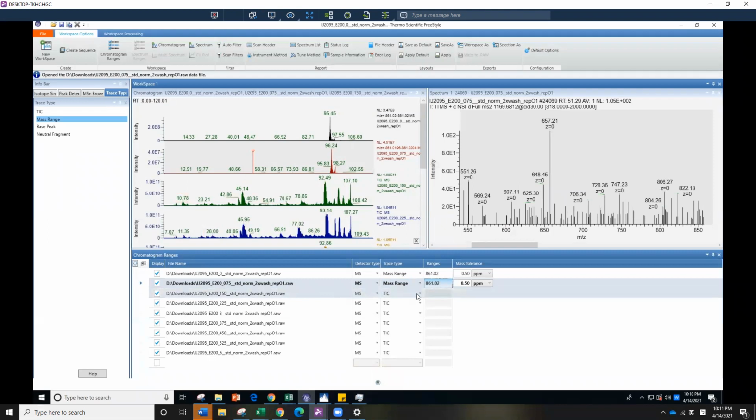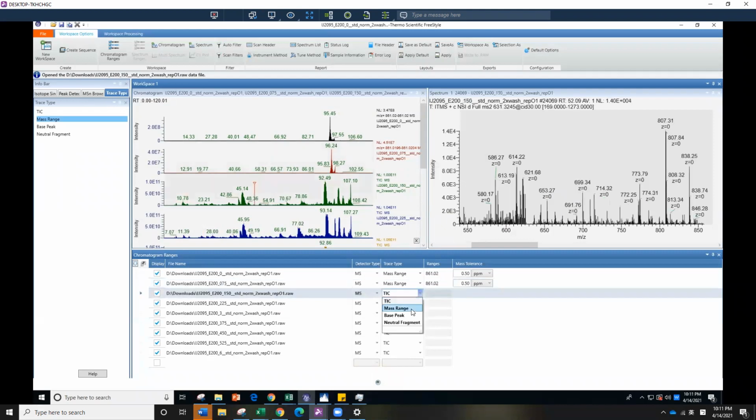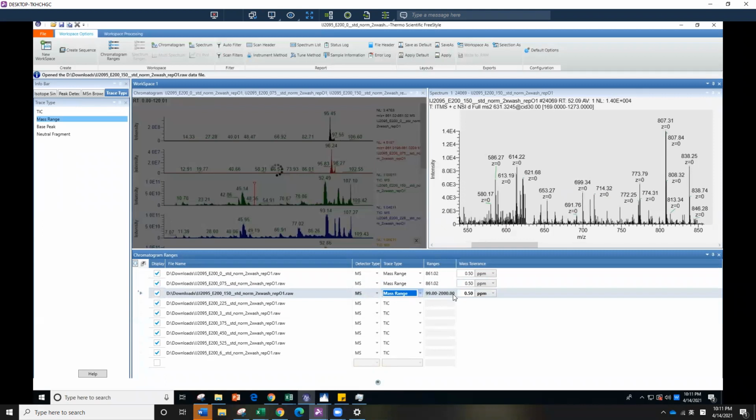I'm just going to do 3 just to take a look. So to look at our retention time besides TIC, what we can also do is an EIC extraction to look at if the retention time aligns.